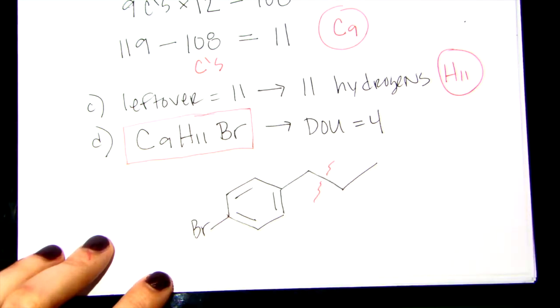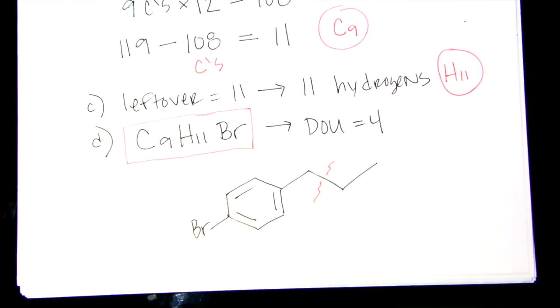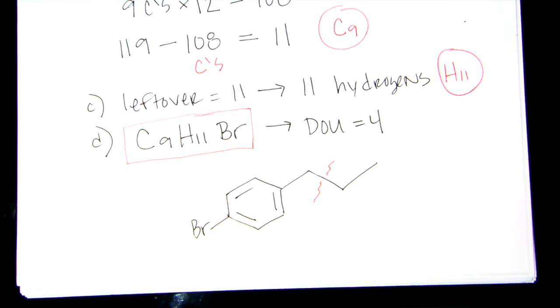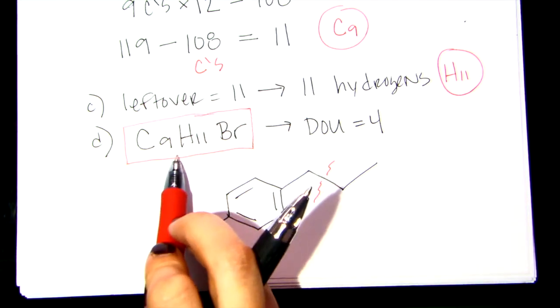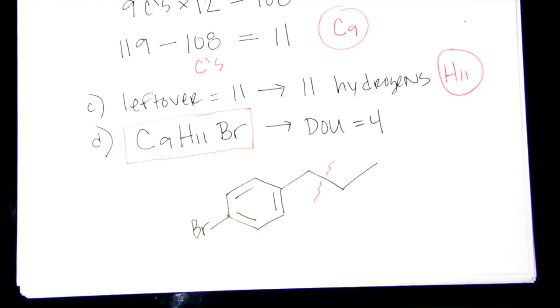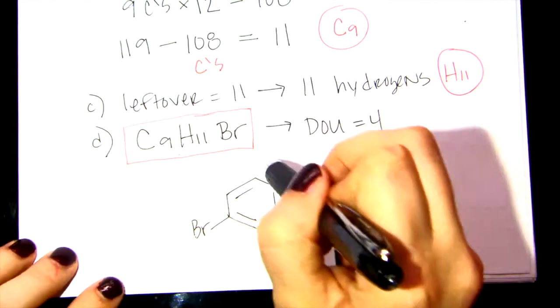That would be a nice stable fragment peak because it would have a cation here, right? And that's not definitively the structure, but that's just a possible structure that would be consistent with what we're seeing. Okay, so when I'm asking you to propose a structure for a mass spectrum, it really just needs to be consistent with the molecular formula. But if you see something really distinctive like an alcohol fragment, you should probably put an alcohol on there. The rest of the structure is kind of iffy. But this could be a possible structure.